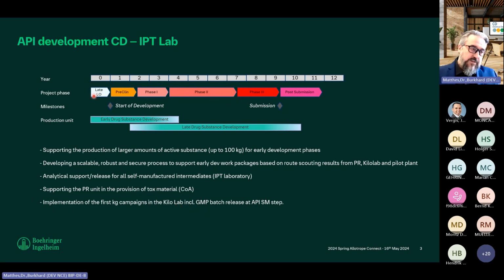So when we start analytics here, we have a non-GxP process through clinical phase and phase 1, and at least at the end of phase 1, we are bound to the GxP process for release of these phase 1 API starting materials and API materials.